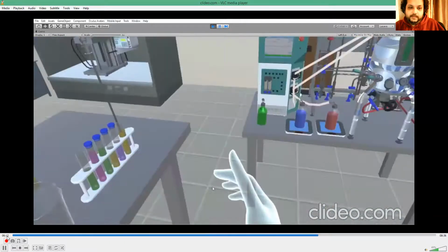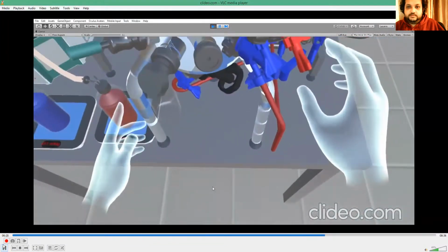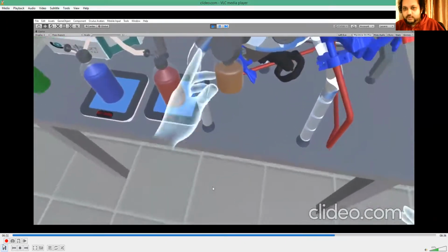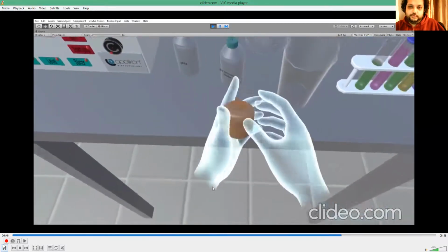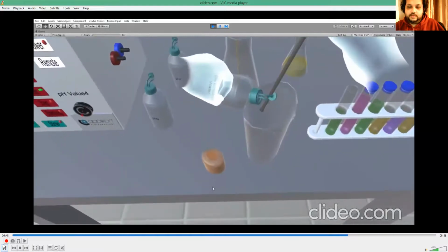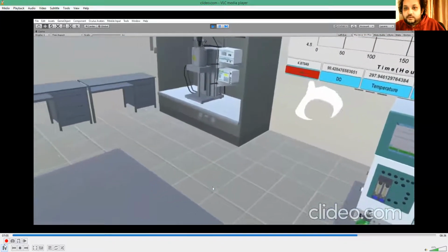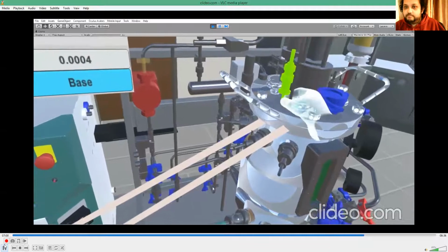While it is being calibrated, we are taking some samples. Of course this is not the exact way of taking a sterilized sample, but it's just to show that these are the actions an operator should do. Now when you check, the value is 4.85, which is roughly the value of the system. So it shows that the pH probe may not be faulty.